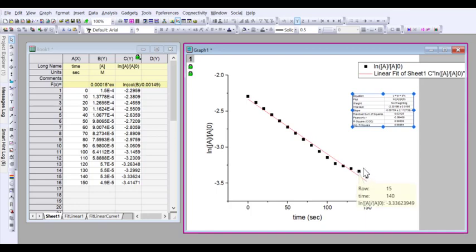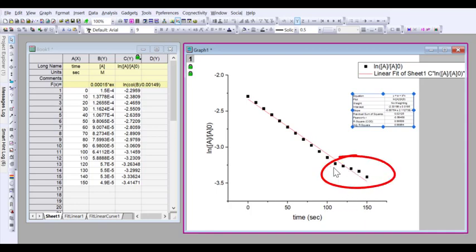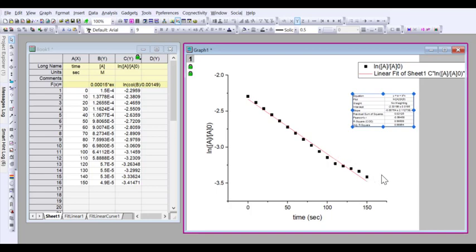However, very commonly in kinetic analysis, we can see here that at later times the concentration ratios, the log is starting to plateau off. This is because the reaction is proceeding for quite a while, so it's probably deviating now from first order conditions.